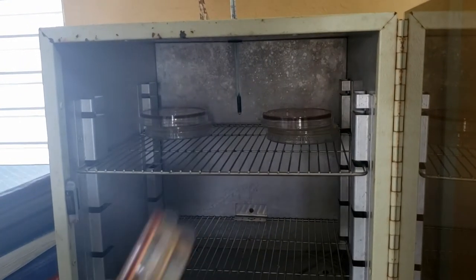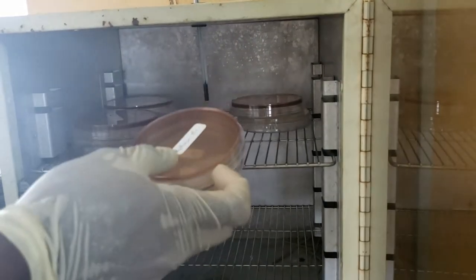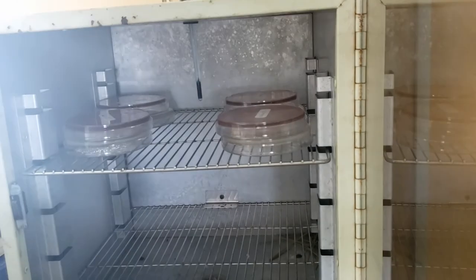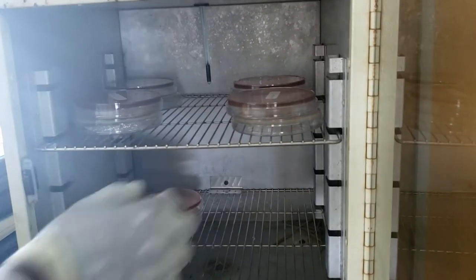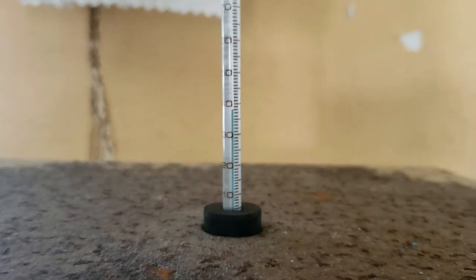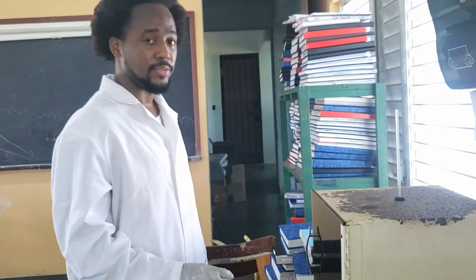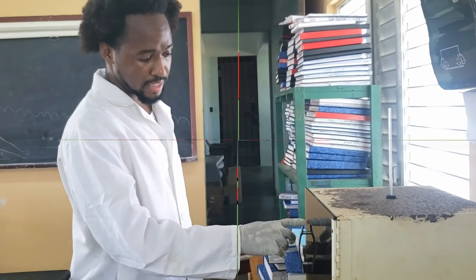Remember again, we have to set them inverted so that any condensation or liquids that form inside do not drip onto the agar media. Already preset it, so the temperature is going to remain between 37 and 40 degrees Celsius. Right now it's at about 39 degrees Celsius, so that's pretty good, and we're going to come back within 24 hours and recheck these plates to see if we've had any bacteria growth on the agar.